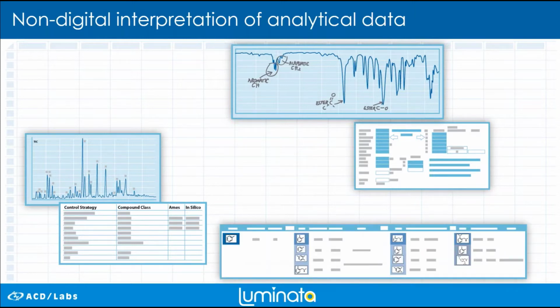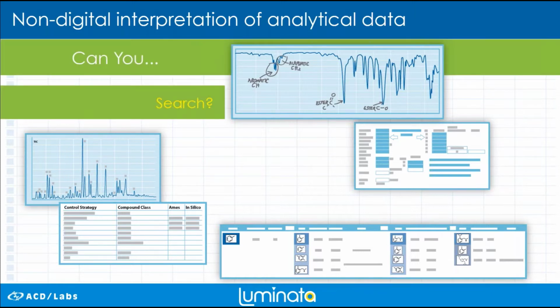Now, finally, things that we've seen is that by having this disconnect, users start not using their chemical drawing packages. So you're not using ChemSketch or ChemDraw or ISIS. You start putting all this information within the same Excel sheet. So in this case, it's a 2 to 3 step reaction all the way to the API product. And what users would do is place all the impurities per stage down below with maybe the registration number, comments, in silico predictions. But that always raises the question, how are you searching any of this?